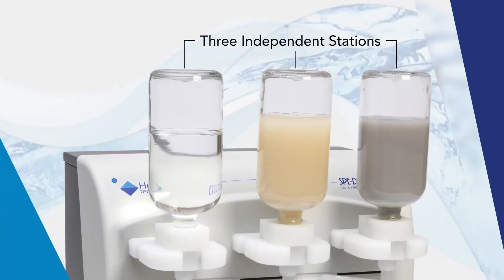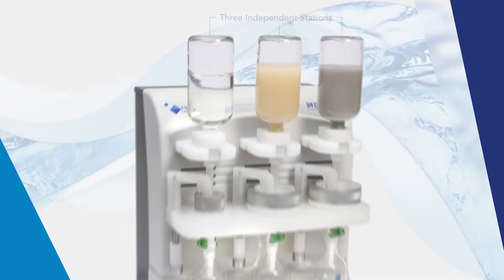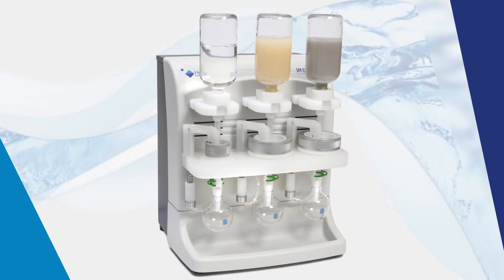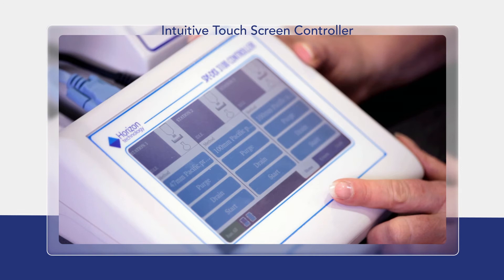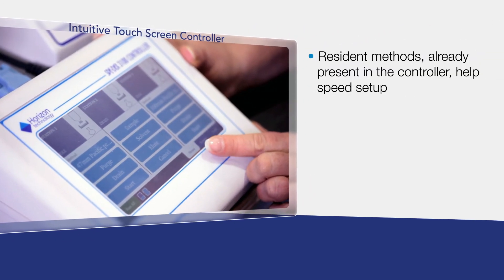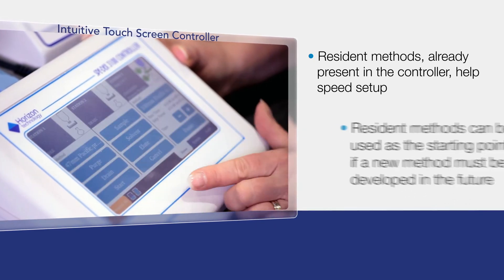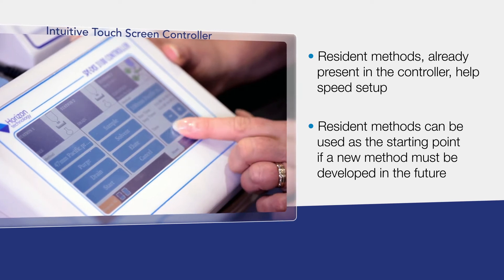The instrument has three independent stations to better match your laboratory's workload. All incoming samples can be processed, whether highly-particulated or not. The color touchscreen controller with intuitive icons makes learning easy, especially for new technicians. Resident methods, already present in the controller, help speed setup, and can be used as the starting point if a new method must be developed in the future.